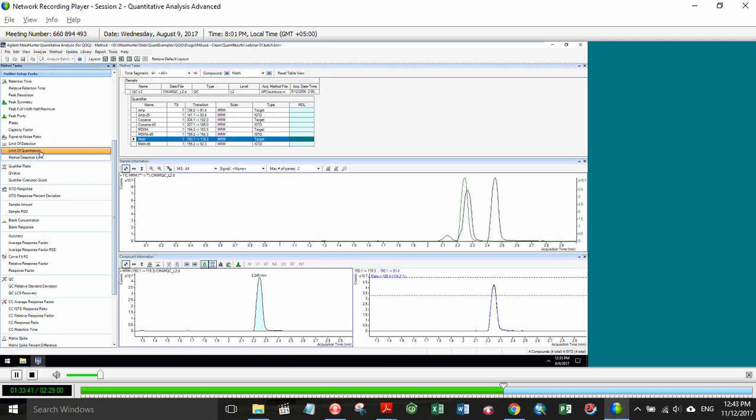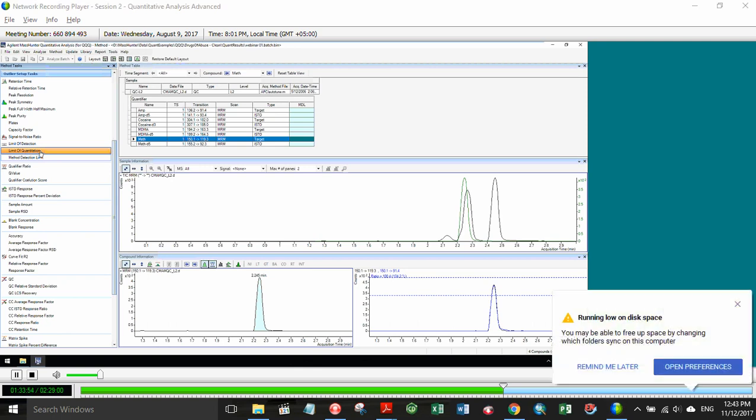Right. Well, and I guess what you could do if you wanted is to set the outlier and then make it so that in the batch table you only show the rows or columns that don't contain any outliers. And then you wouldn't see the ones that were below. You would only see the ones that were above. Or, yeah, well, as you say, it is kind of one-dimensional. We only have one column for this, whereas for the ones that are, well, okay, that's not the best.